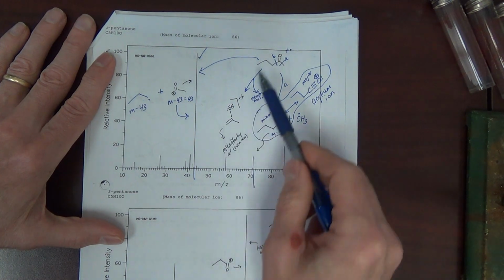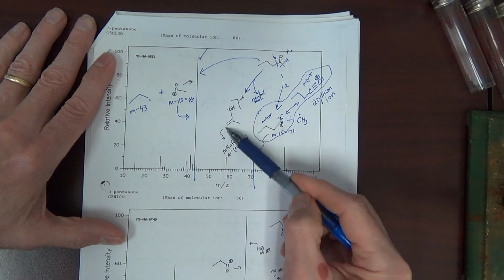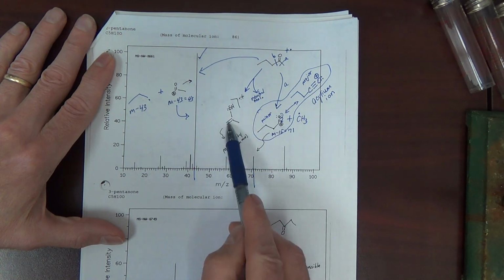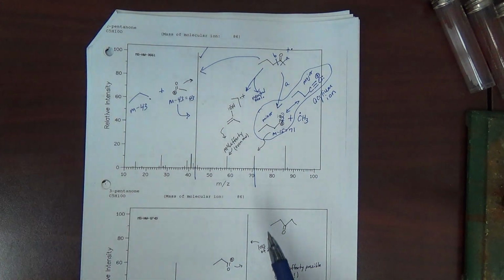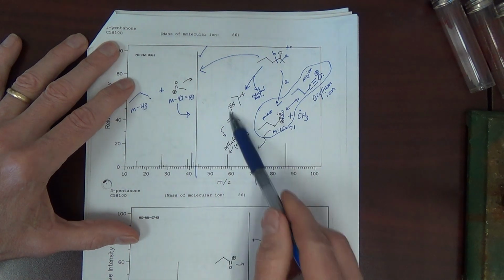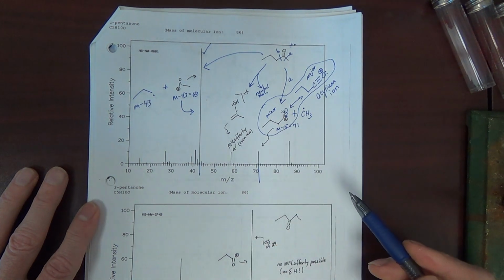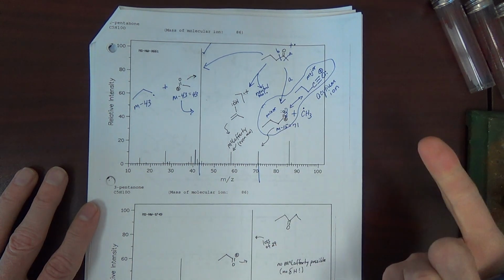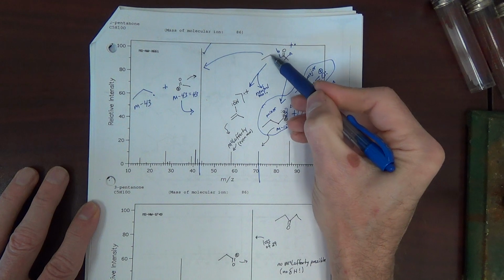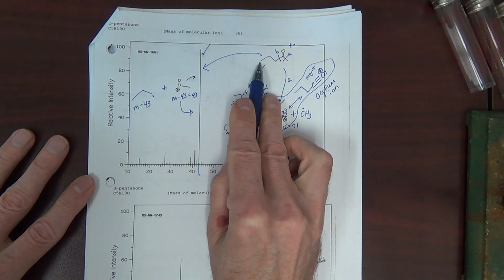One thing you'll see is typically when the cleavage takes place, the fragment here is in an enol form. Then this can, of course, undergo tautomerization, and the keto form may be shown in your textbook. But there is sort of a cyclic transition state here. Okay, so look at that on your own. One thing we can state is that the McLafferty does require a gamma hydrogen. Alpha, beta, gamma. It requires a hydrogen on the third carbon from the carbonyl. 1, 2, 3. Okay, it's a gamma carbon. There are hydrogens there. You can do the McLafferty because of that.